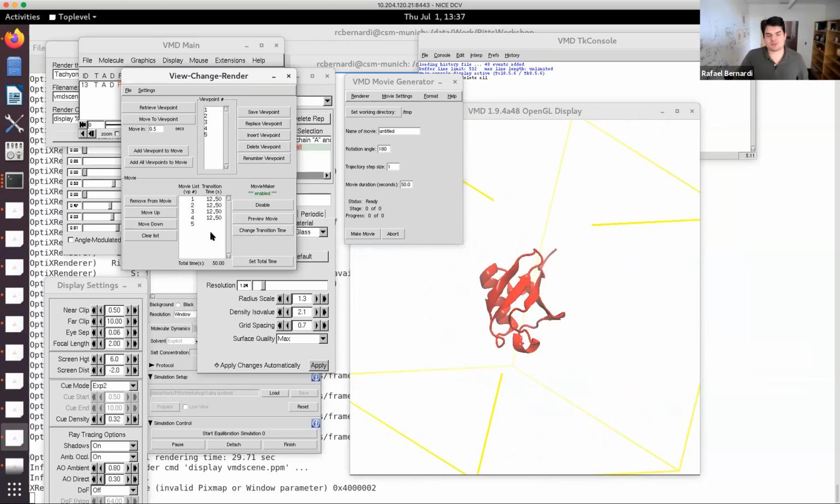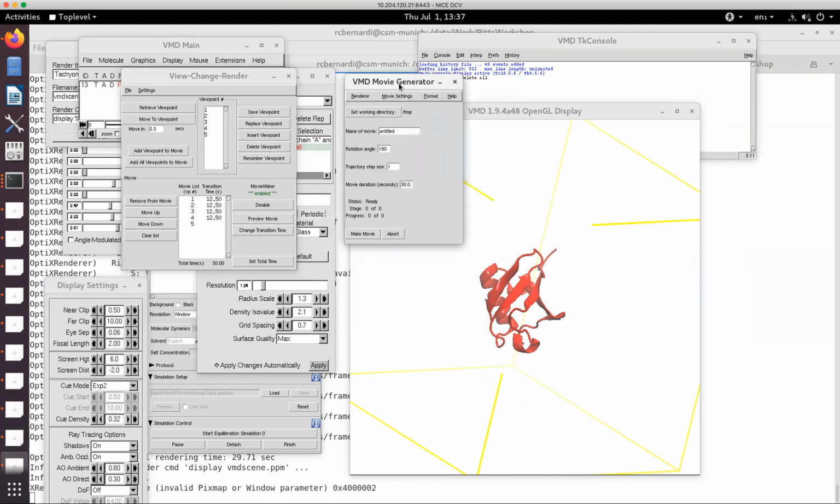Yeah, well, John is suggesting you come here and change the time to a much longer time. You could do that because you're saving 24 frames per second, I think that's the default. So if you're running 24 frames per second, you're rendering 50 times 24 images here. If you want to do like 100 seconds, even if you want a shorter movie later, it's easier. If you're going to stretch it, it's going to look bumpy. It's going to look not so nice.